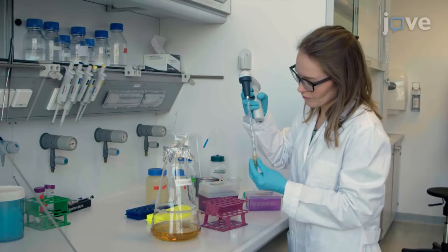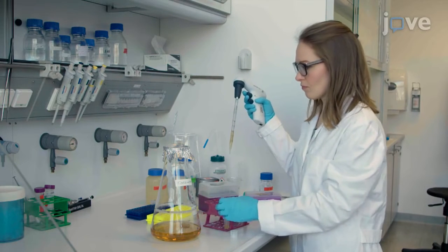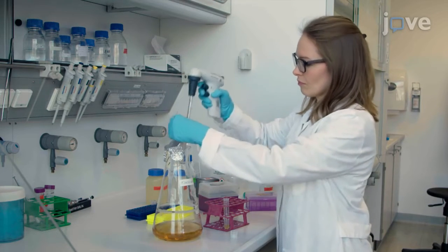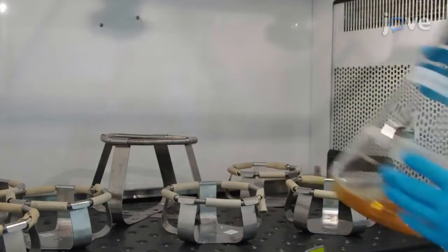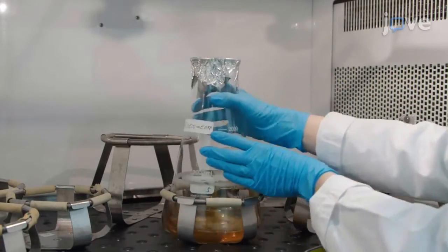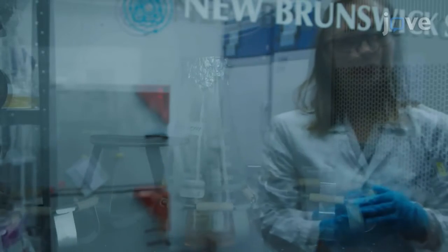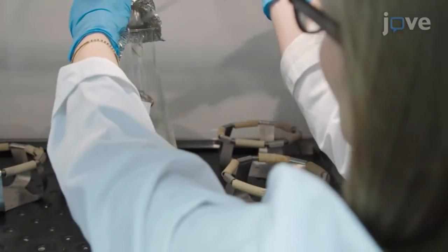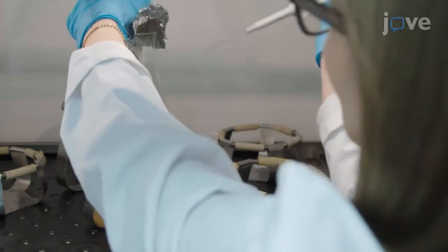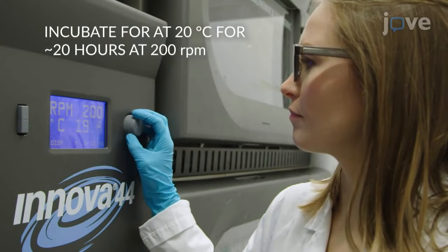For expression of F20E20M EGFP and F20E20M cherry, inoculate the main expression culture from the overnight pre-culture to an OD600 of 0.3. Incubate it in 400 milliliters of sterile LB medium supplemented with appropriate antibiotics at 37 degrees Celsius and 200 rpm. When the expression culture reaches OD600 of 0.5 to 0.8, add IPTG to a final concentration of 1 millimolar and reduce the incubation temperature to 20 degrees Celsius.